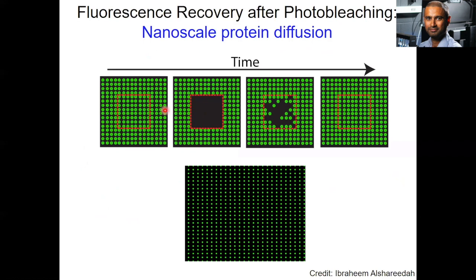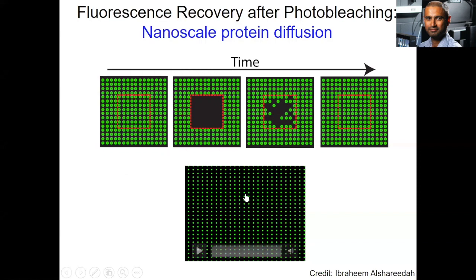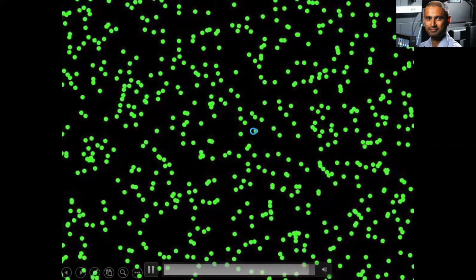The molecules undergo photo deactivation permanently, but if there is diffusion, molecules from the surrounding medium could diffuse to the bleached region, and you'll get some sort of rate of diffusion. Here I have a simulated movie that shows that if you bleach it, and if there is high internal dynamics or diffusion, you could actually regain the loss of fluorescence.